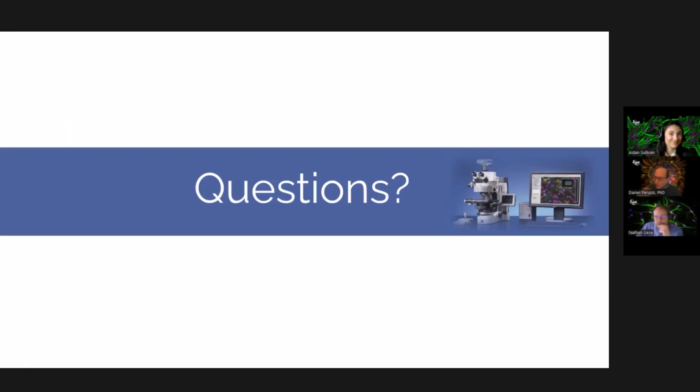Okay. Well, let's see. We've got our first question in here. It's from Gavin. How many microns is generally acceptable for the interval between Z-stacks? Well, you need an interval that will let you section through the cell several times, many times. What we want to do is, well, let's see. Okay, interval between Z stacks.